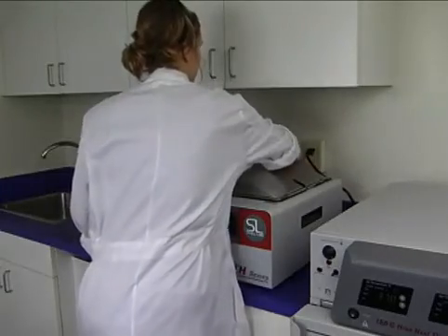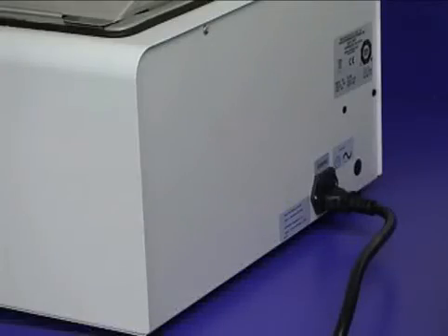The pocket handles embedded on the side of the unit allow the water bath to be easily lifted for cleaning and relocation.